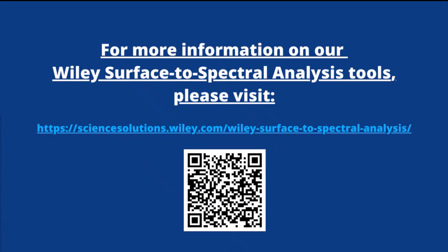There's also a profiler extension add-on for profilometry and surface topography. And if you have KnowItAll software and libraries, which is standalone software, not technically an add-on, in addition to surface-to-spectral analysis, you can search specific spectra against our IR, Raman, or UV-Vis spectral libraries.